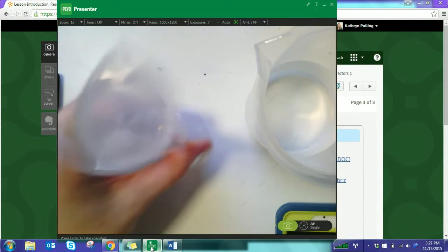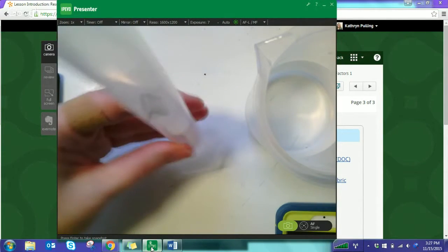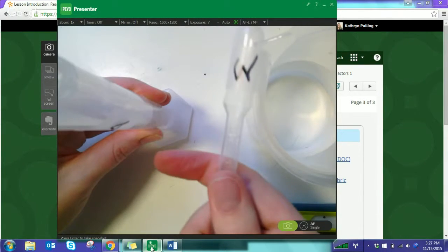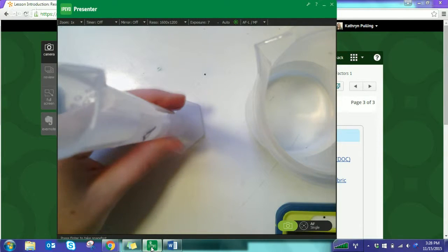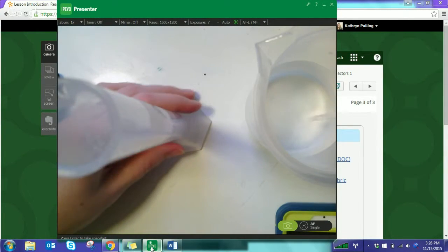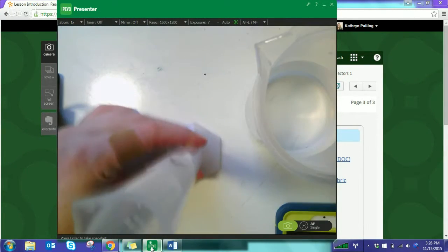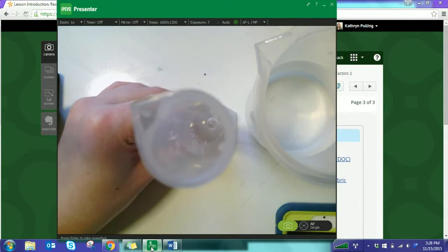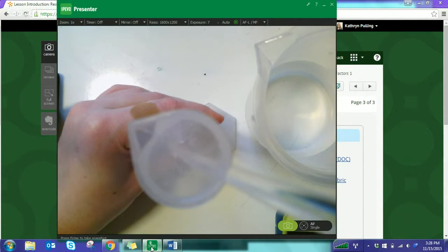And what I'm going to do into that same graduated cylinder, so into A, I'm using my water pipette to add 5 milliliters of water, which means I'm going to fill it up till we hit 20 again. All right, so use the water pipette in water only.